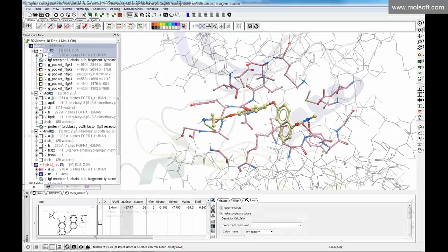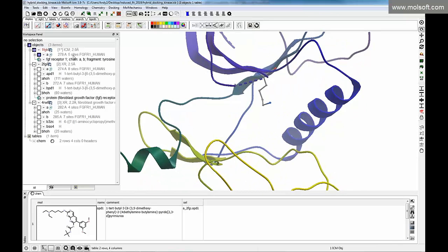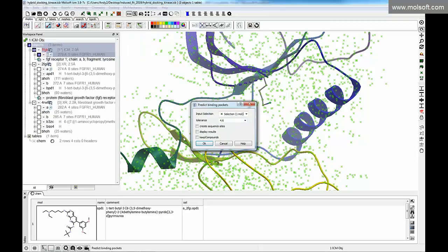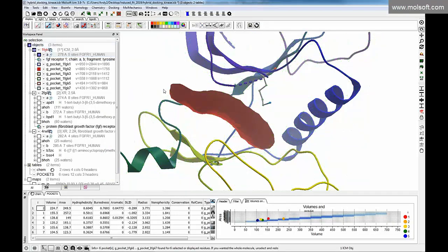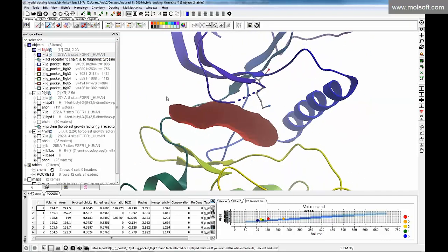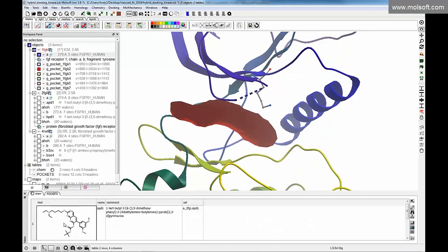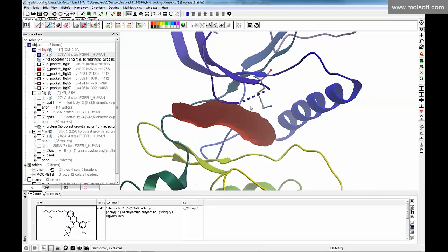How do we do that? It's pretty straightforward. One good thing would be to find the pocket, so go to Tools, 3D Predict, ICM Pocket Finder. This is the ATP pocket. If you were just visually looking at it, you would probably question whether the pocket is a reasonable size to dock these inhibitors. These are quite large, so you may think about opening up. Fortunately, we do have holo structures, so we know that in this case that lysine does move.